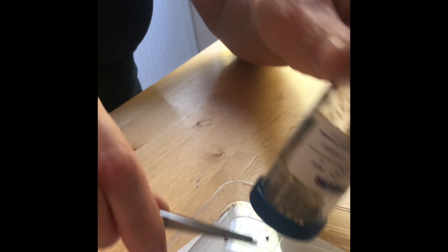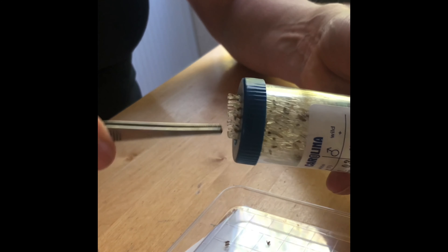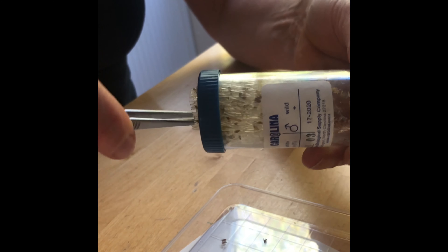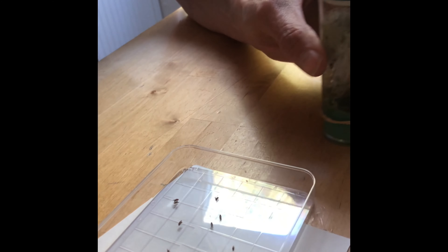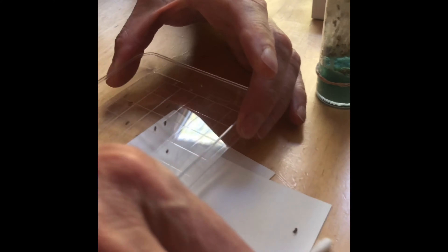I did mention that I actually haven't done this before, so thank you for your patience. I'm going to work on getting the flies out a little bit, but I'd like you to join me now in my little experiment where we'll see if we can figure out some phenotypes and if we can sex the flies.